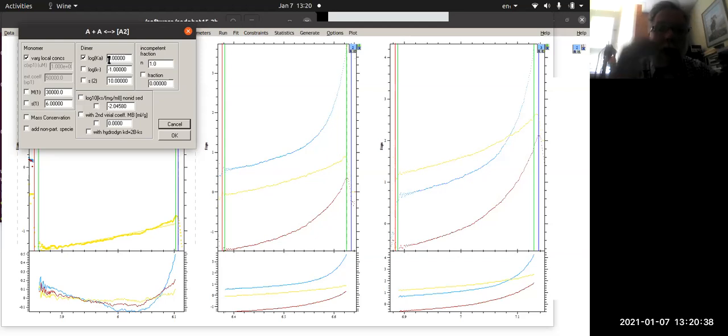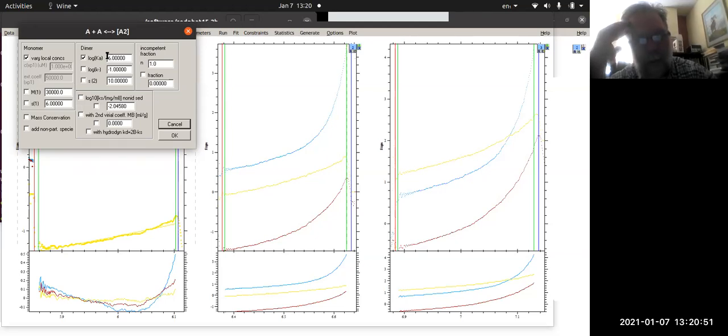So if I made this 6, then this would be saying that the per molar Ka is 10 to the 6, meaning that the Kd for dimerization would be 10 to the minus 6, or micromolar. That sort of thing you would probably be able to see in analytical ultracentrifugation, and you'd be able to fit it in this sort of modeling.